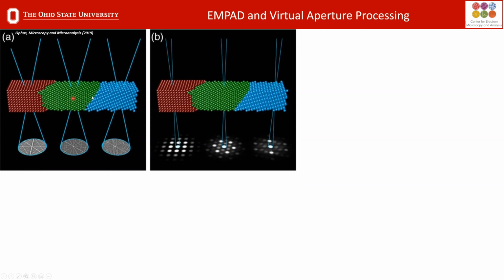So what we have here is a crystal, and what this is representing is 3 different crystals with different orientations and grain boundaries. And what happens when we put a converged beam on one of these regions is you either get out Kikuchi lines, which you usually do. If the sample's thin enough, you won't see the Kikuchi lines, but you'll just see the diffracted intensities. And this is what we would call a CBED pattern, a convergent beam electron diffraction pattern. And as a microscopist, this is what you see in the microscope all the time. And we start to relate what these structures are and just naturally see the crystal structure.